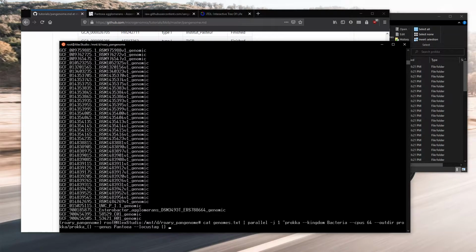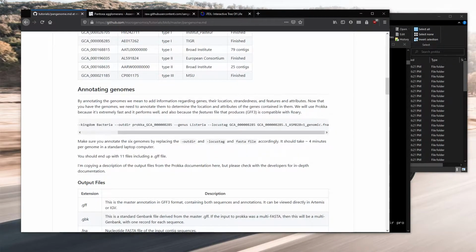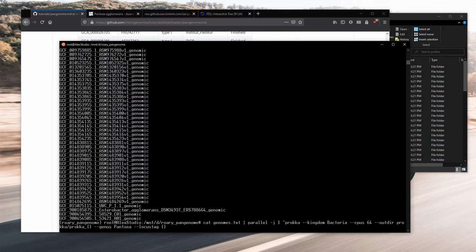And then we need to tell it what are we actually going to annotate. So the last part is the genome file. And for me, that is in ncbi-genomes, genomes-2020-1127. So it was a couple days ago. And then refseq-fasta/ and then curly brackets .fna.